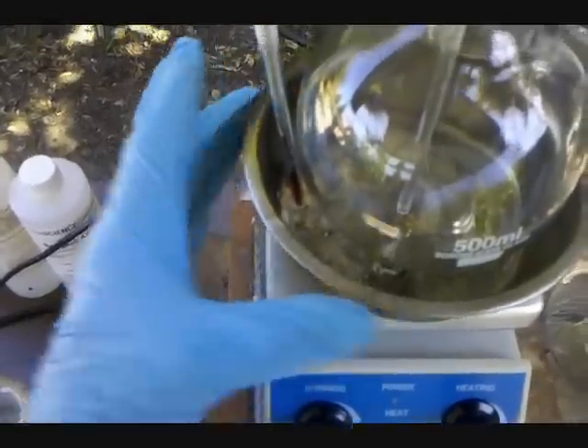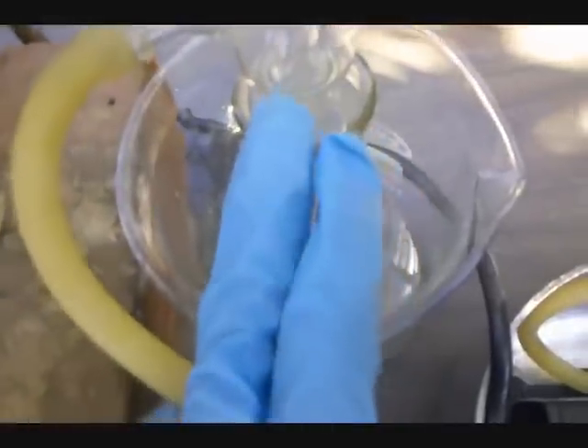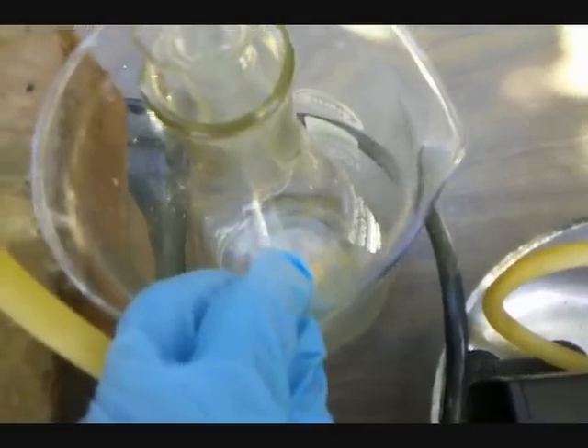I'm going to be using a hot oil bath. I've got a thermometer to monitor temperature. I want the bath at around 135 degrees Celsius. Normal distillation setup, and then it goes into this Erlenmeyer flask. I've got it surrounded by a beaker that I'm going to be packing with ice to keep it from evaporating as much as I can.